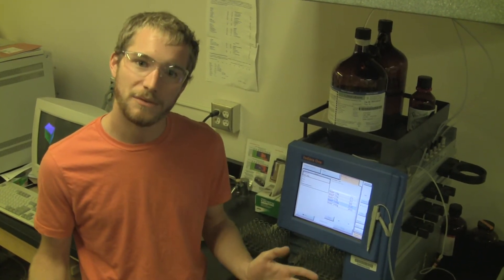This is an automated flash chromatography machine. We use this to purify molecules that we build here in the Bazan lab. A lot of these materials are small molecules and polymers that are fully conjugated.